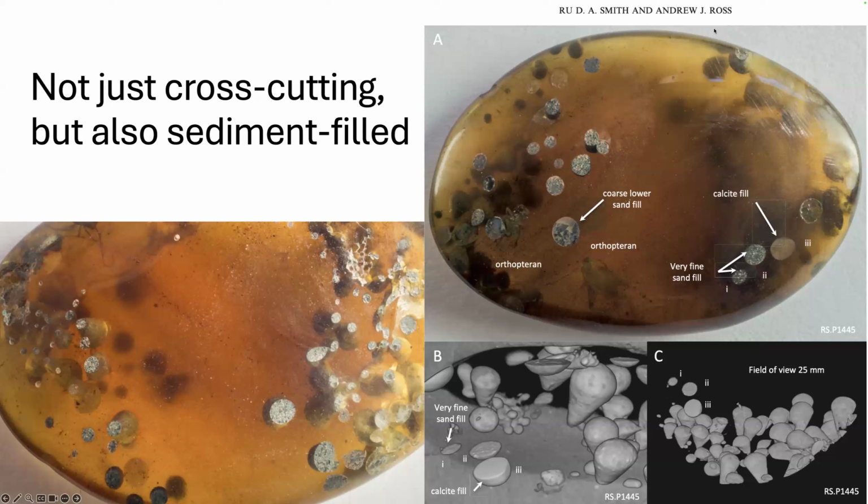So far we've got cross-cutting relationships, we've got sediment fill, and in another specimen, I found the actual bivalves still inside their crypts, domicnia it's called, their dwelling structures. And this one is amazing because you can just about see a crisscross pattern. And that's the mark that it makes when it rasps, when it's actually boring into something hard. So we've got those 3 observations.